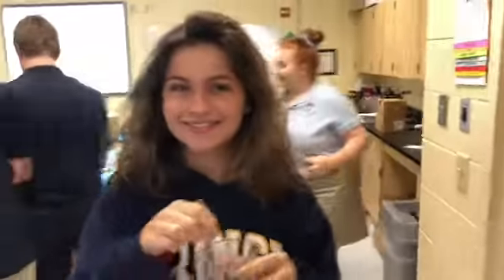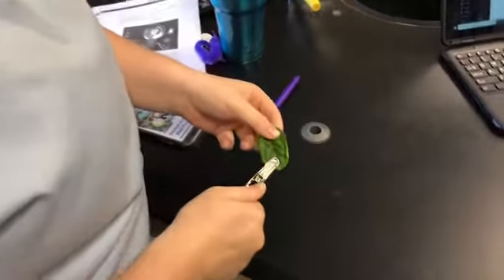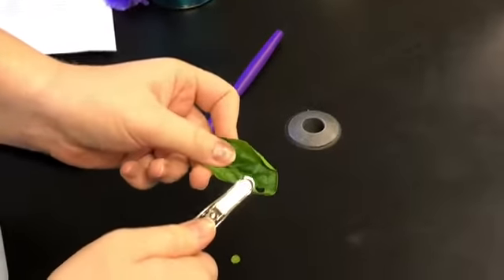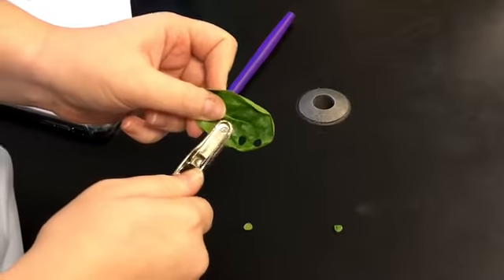For this lab, we had to make the leaf chads sink. To do this, we took a syringe full of the chads and the solution and created a vacuum. To create this vacuum, we put our thumb over the syringe and pulled down while shaking. This takes the air out of the leaves and replaces it with water, making the chads sink. We then placed the chads into the beaker with the rest of the solution, and then we could carry on the rest of our experiment.